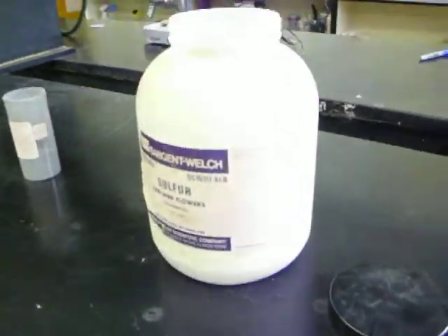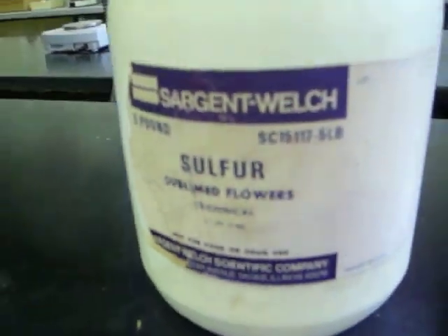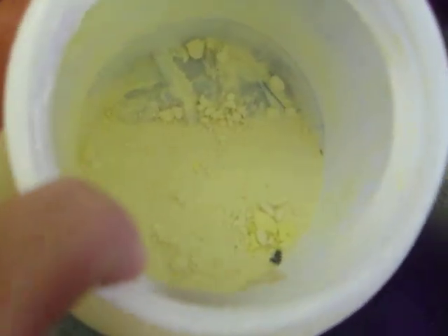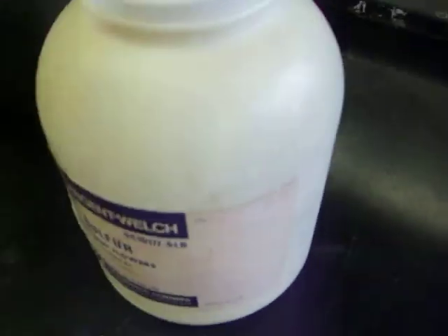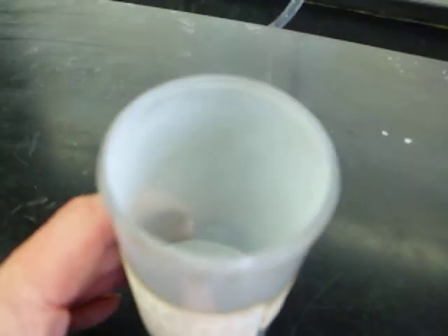Alright, here is the first ingredient. The first reactant is sulfur, as you can see inside there. The second ingredient is zinc dust. This is zinc dust.